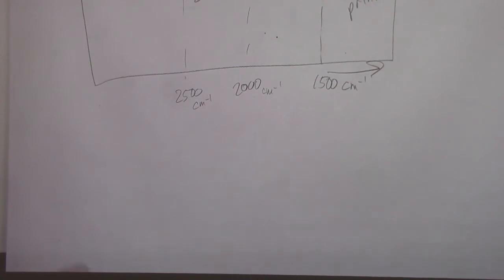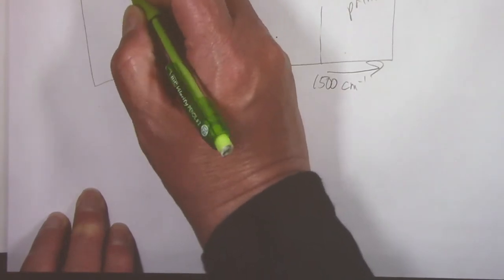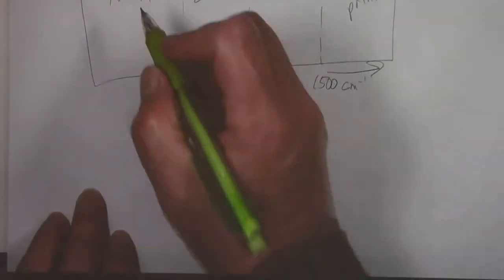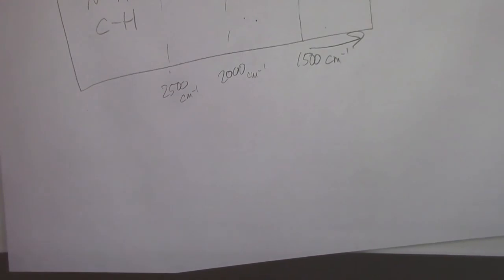And then in this region, you have your OH, your alcohols are there, you have your NH, your amines are there, and you have your CH, right? And so you're going to remember very specifically the 3000 mark, and if my stretches are below that, I have CH saturated.